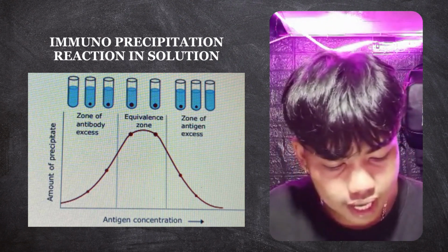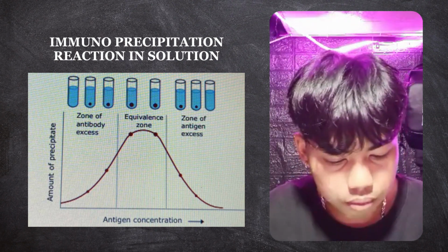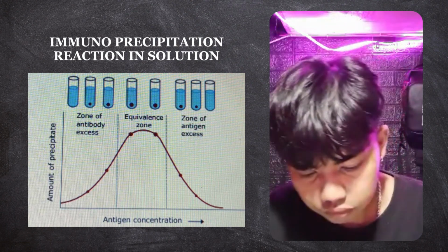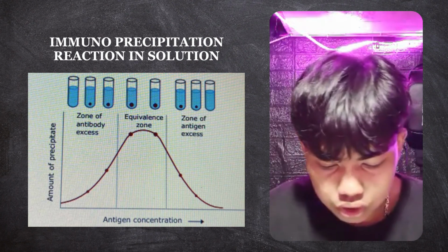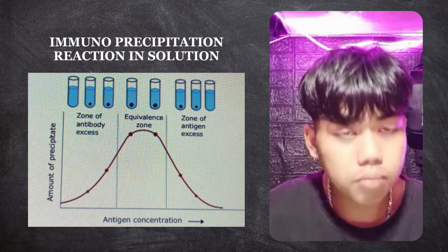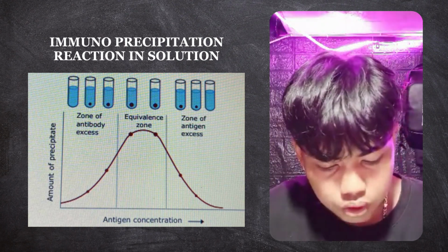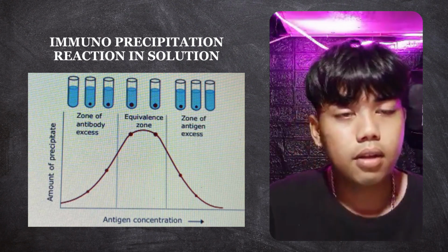So the last one is the analysis. In the analysis, bands on the gel or membrane are analyzed to confirm the presence of the target protein in the precipitated sample. By combining immunoprecipitation with gel electrophoresis, researchers can specifically isolate and analyze proteins of interest from complex mixtures. The technique is valuable for studying protein-protein interaction, post-translational modification, and assessing protein levels in various experimental conditions.